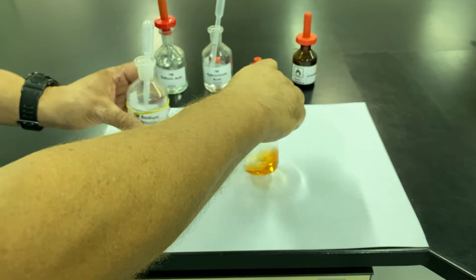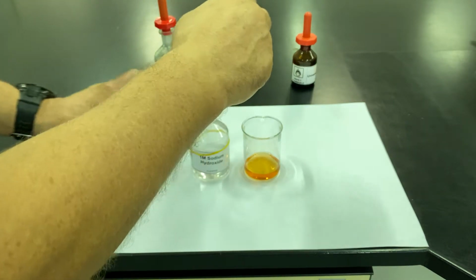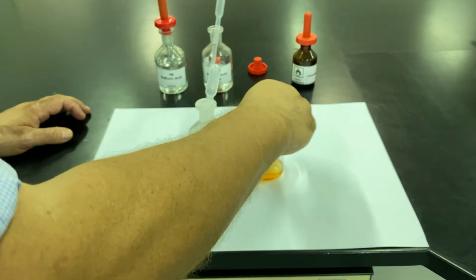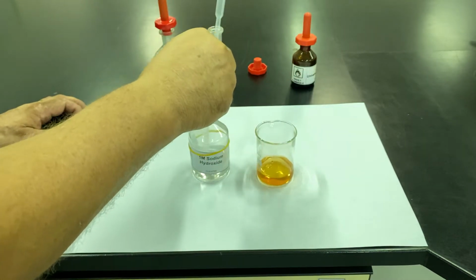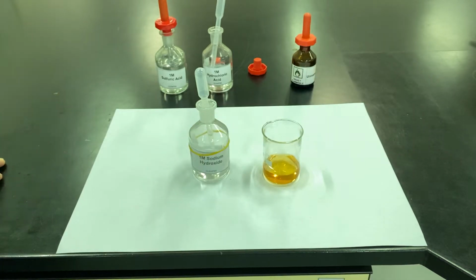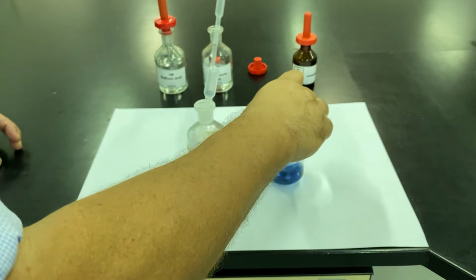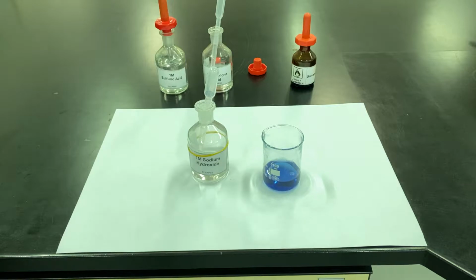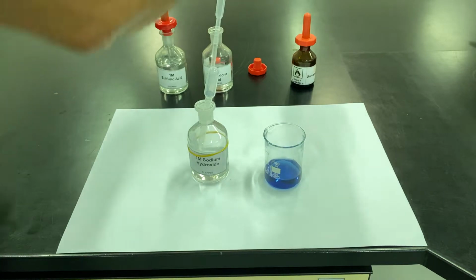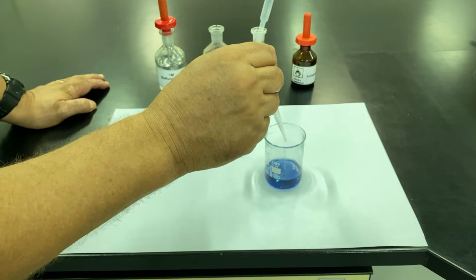Okay. Still an excess of hydrochloric acid, so I need to keep going with, almost there. I need to keep going with the sodium hydroxide. Right. Almost there. So have I gone too far? Yes, I've now gone too far with the sodium hydroxide. So I need to go back again with the hydrochloric acid, but I've not gone too far past it.